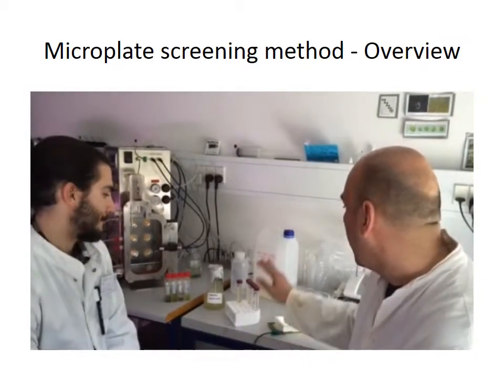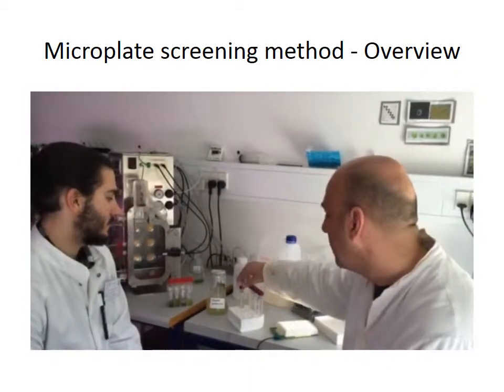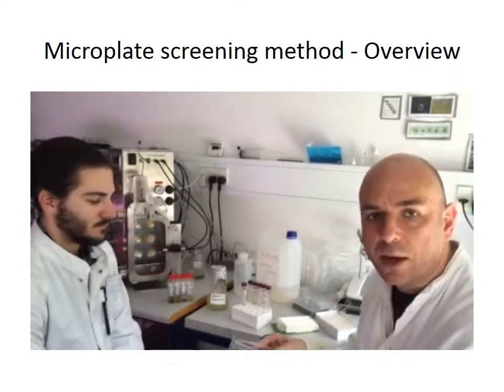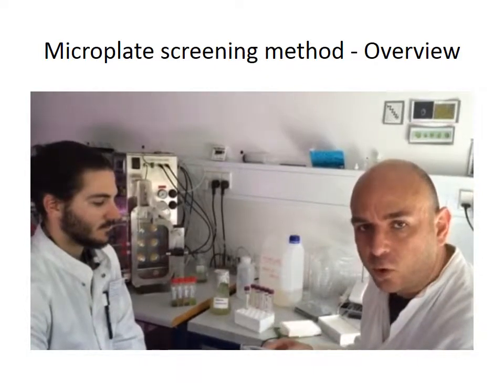So here we have wastewaters coming from Estonia, and here we have many different other ones. So we are going to show how we use these microplates in order to test different conditions in very small volumes.